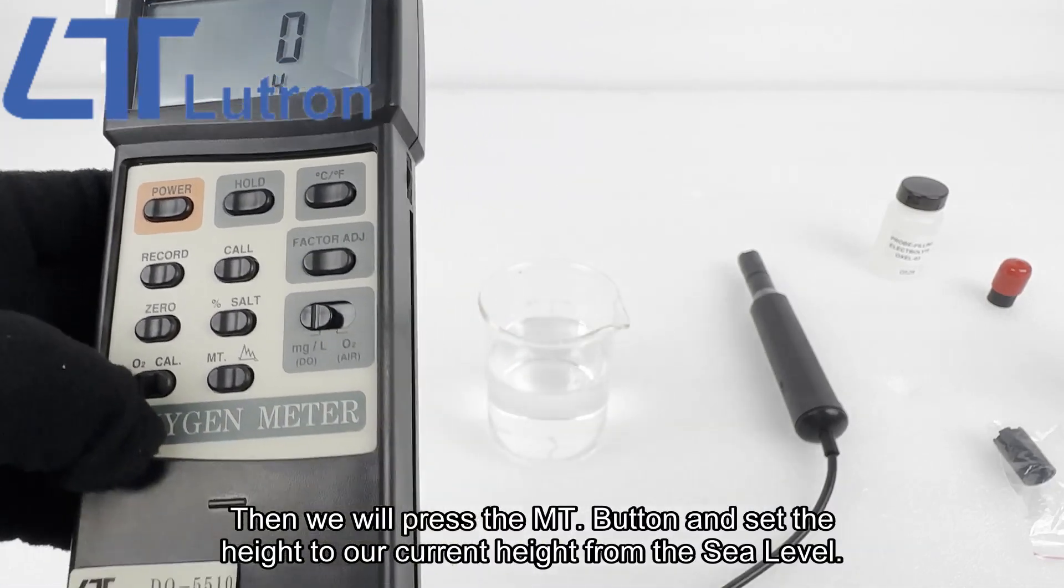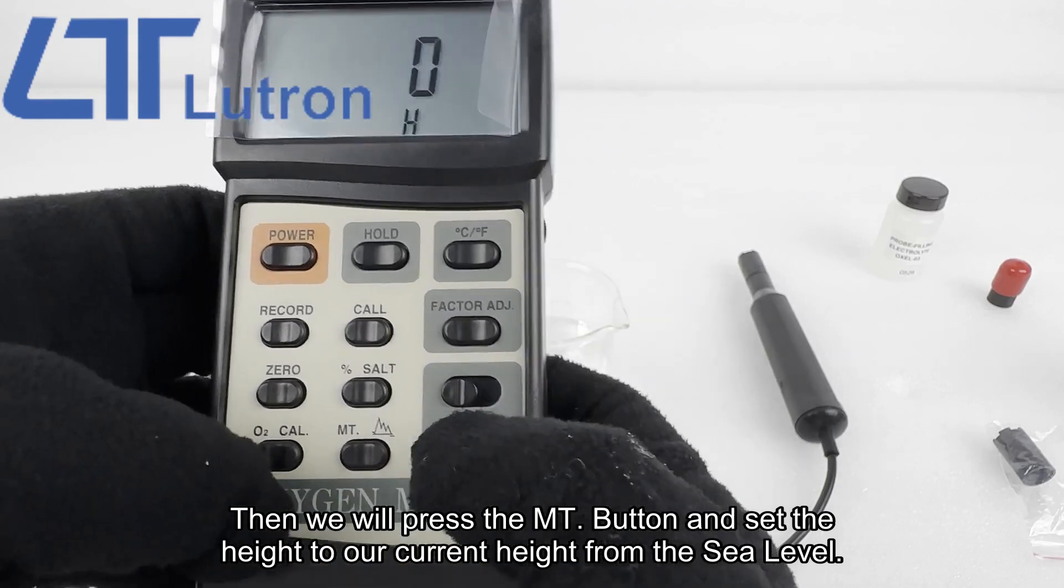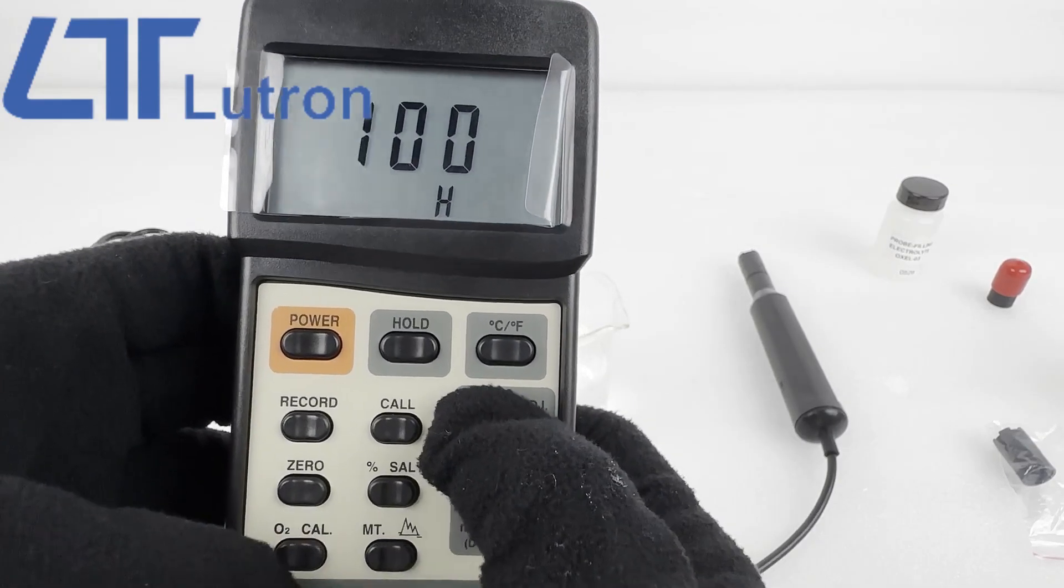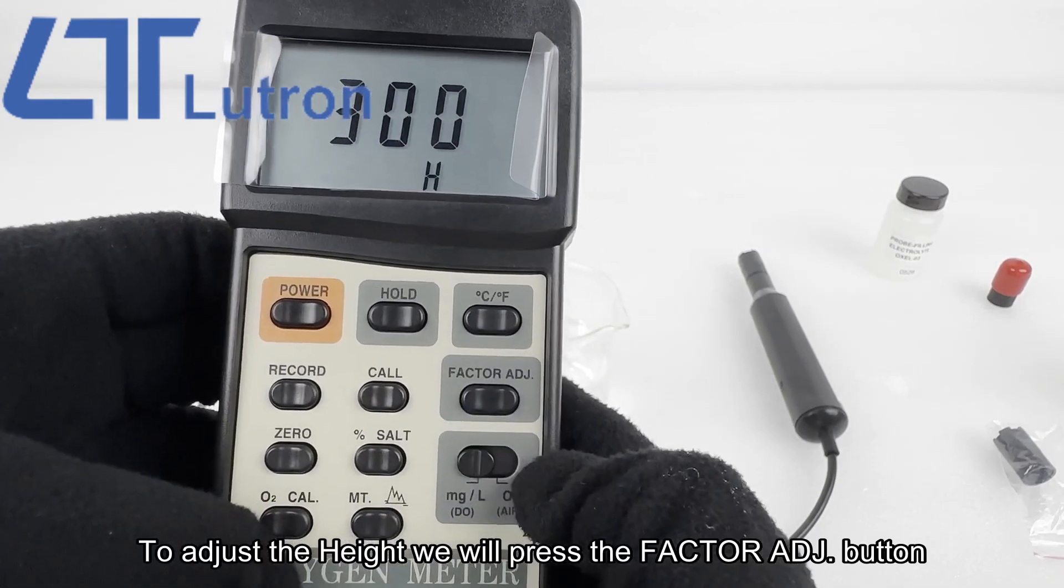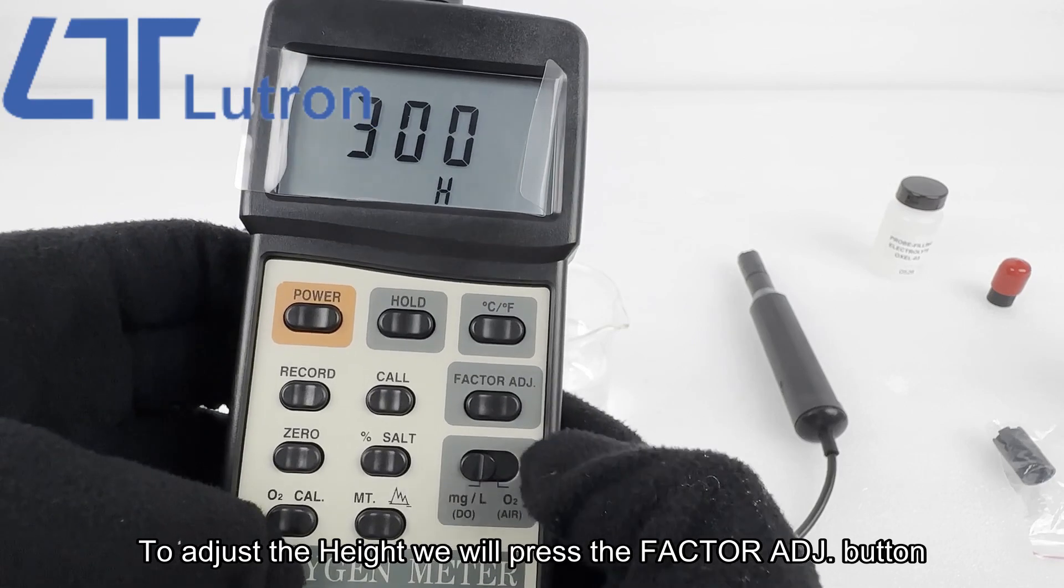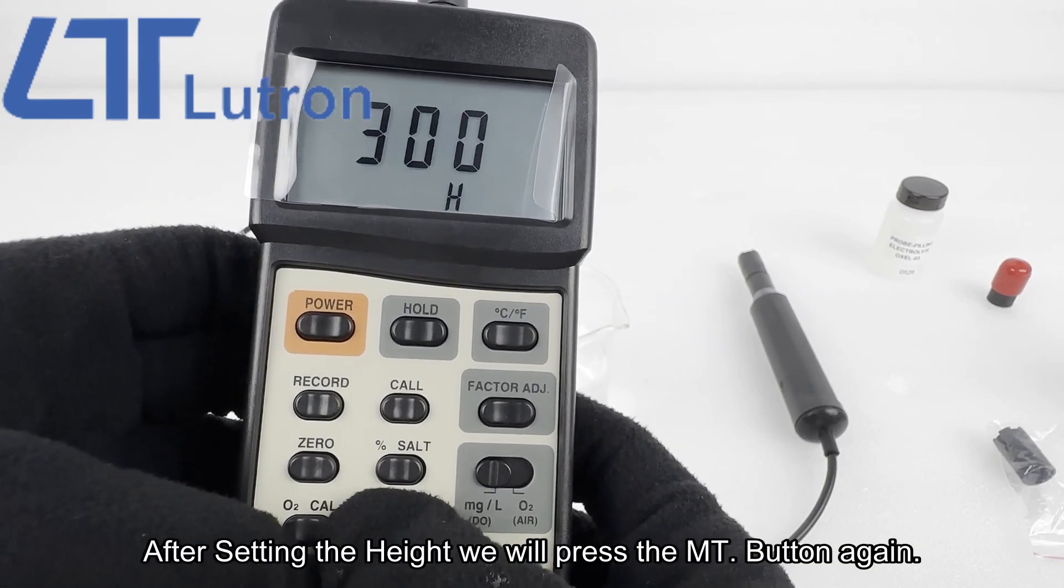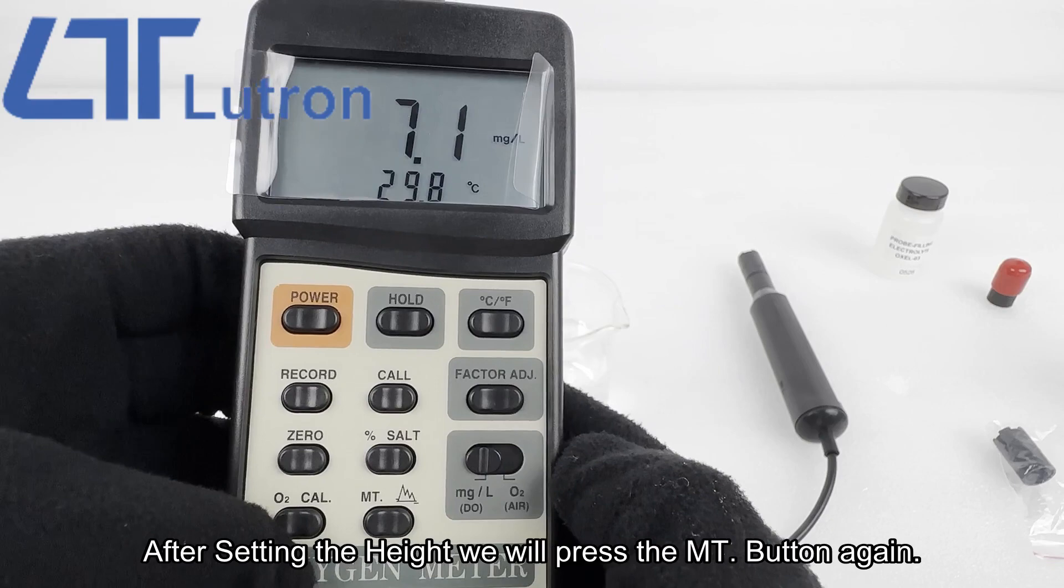Then we will press the MT button and set the height to our current height from sea level. To adjust the height, we will press the factor ADJ button. After setting the height, we will press the MT button again.